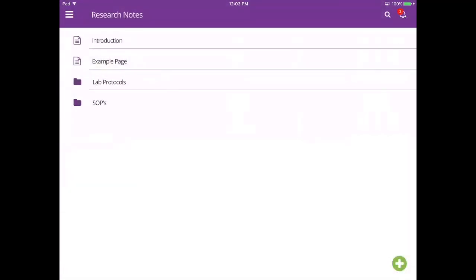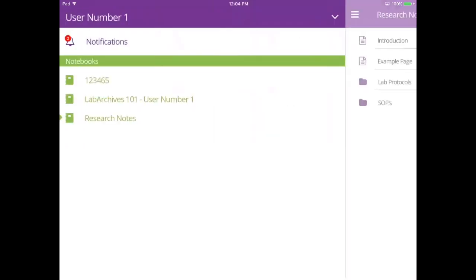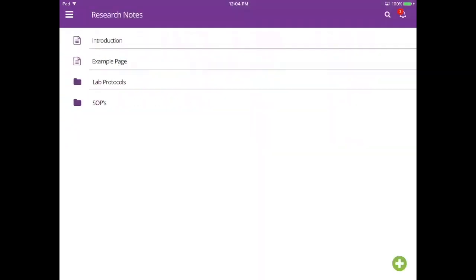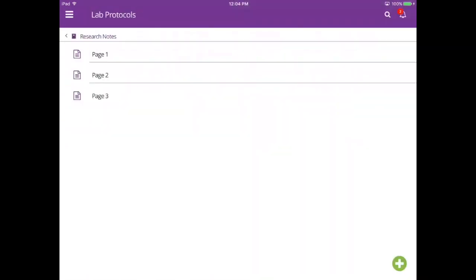Once you log in, you will see the structure of your notebook. This functions like the notebook navigator. To view a different notebook, tap the triple bar menu on the top left, and to view the contents of a folder or page, tap on the name.